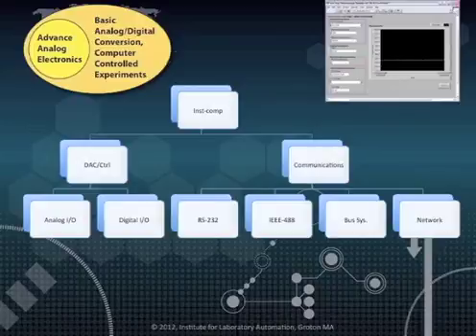Instrument communications take place through four types of devices. RS-232 and similar protocols are used for serial data. At one point, this was a very common way of making connections between computers and intelligent devices, since the device can be made to appear as a keyboard-printer combination and programmed the same way we would talk to or read from those types of devices.